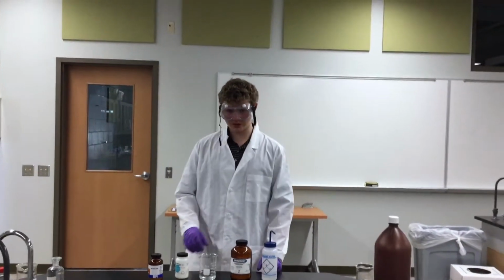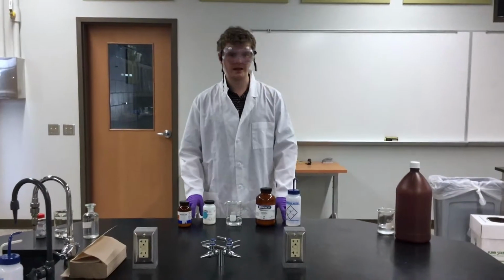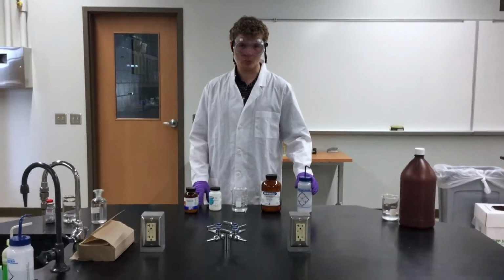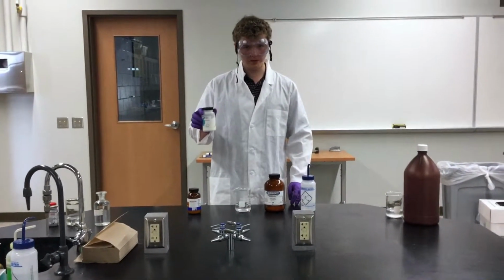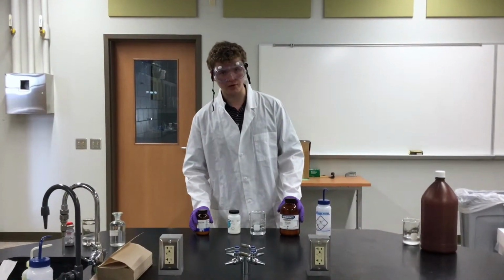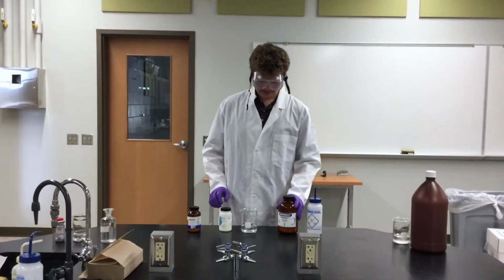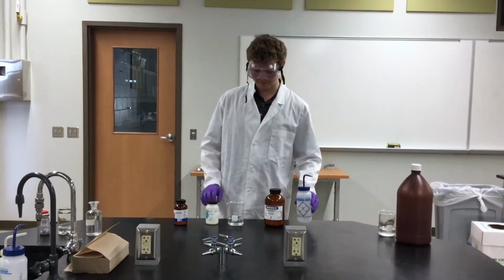This is solution C, our starch solution that will be used as an indicator in the reaction. To make this, we take 90 milliliters of deionized water and bring it to a temperature of 100 degrees Celsius. At this point, you can add 0.1 grams of Vitex starch to the solution, 1.5 grams of malonic acid, and 0.4 grams of manganese sulfate monohydrate. The entire solution is diluted to 100 milliliters using deionized water.